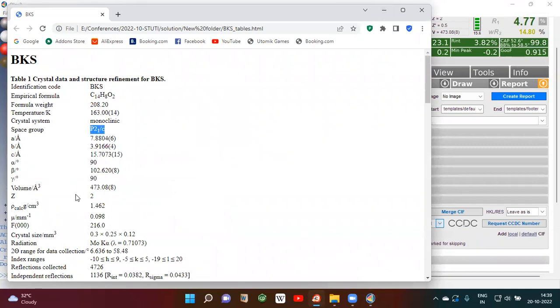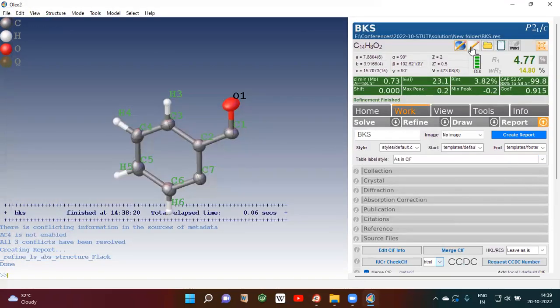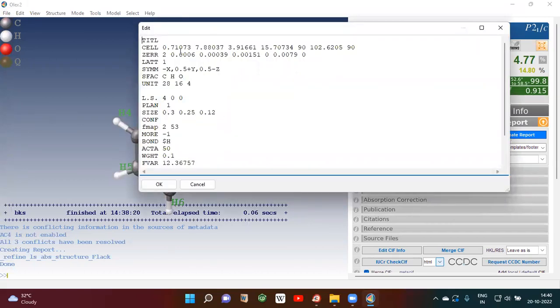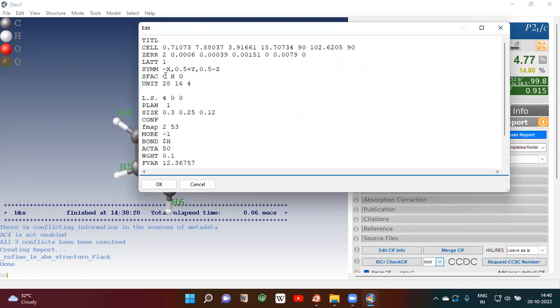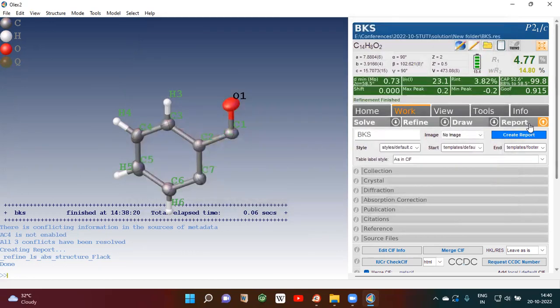The space group, A, B, C, alpha, beta, gamma, and Z value are all given. Here you can see the wavelength and the Z value — sometimes the Z value will be wrong and you have to correct it. There are errors for A, B, C, alpha, beta, gamma listed here. These are the atoms present in the molecule: 28 carbon atoms, 16 hydrogen atoms, and 4 oxygen atoms are present in one unit cell. Sometimes these values will be wrong and you have to correct them, then refine, and then generate the CIF file.